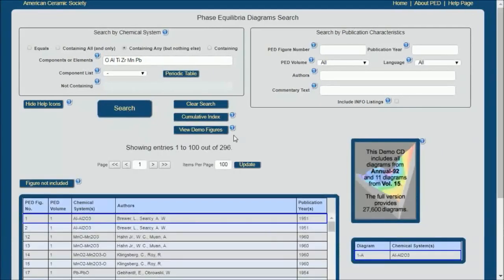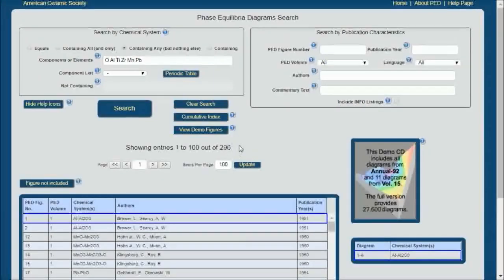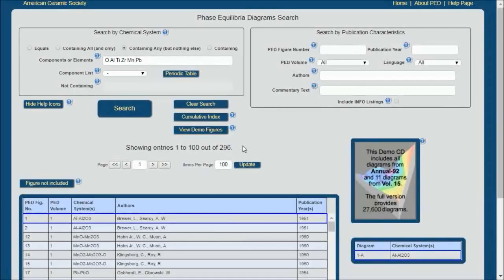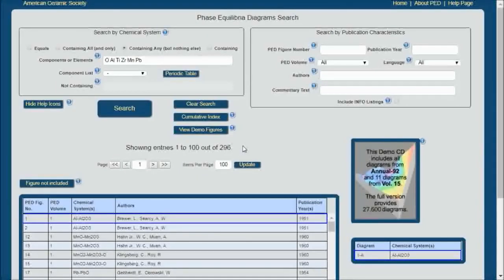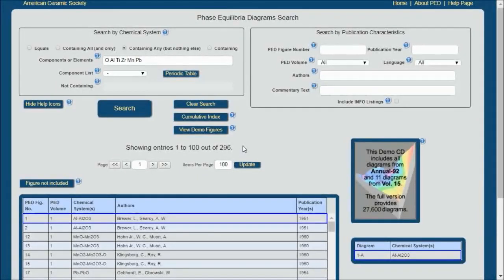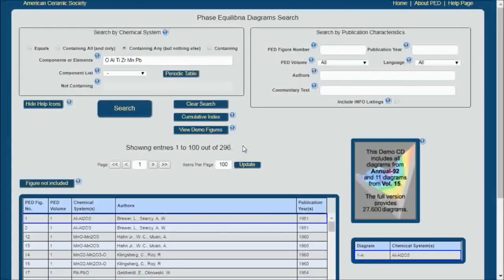Once I've done that, you'll see I still get 296 phase diagram systems, so you can see where having that ability to limit can become quite useful.